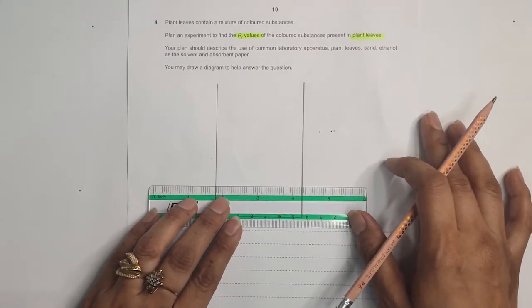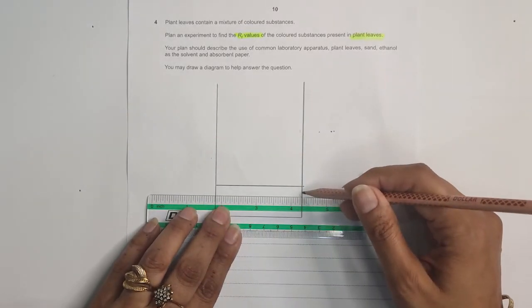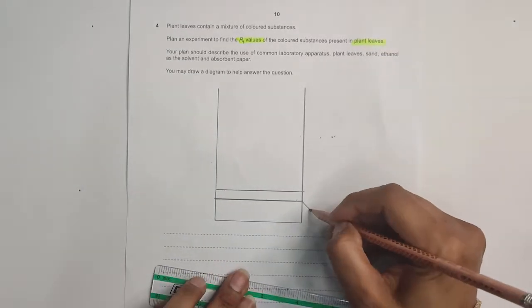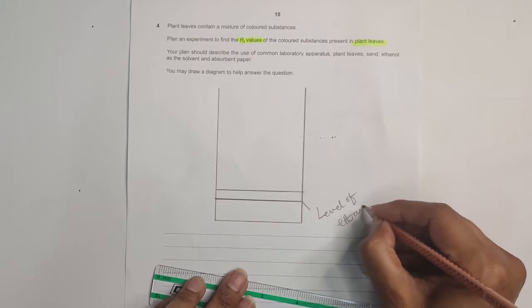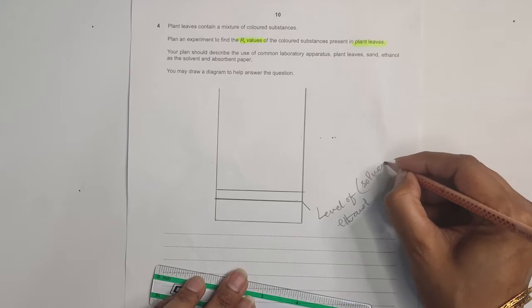We will mark the line with a pencil. This one is our baseline, and the level of ethanol or your solvent should be below it, so we will write here: this is the ethanol or solvent level.